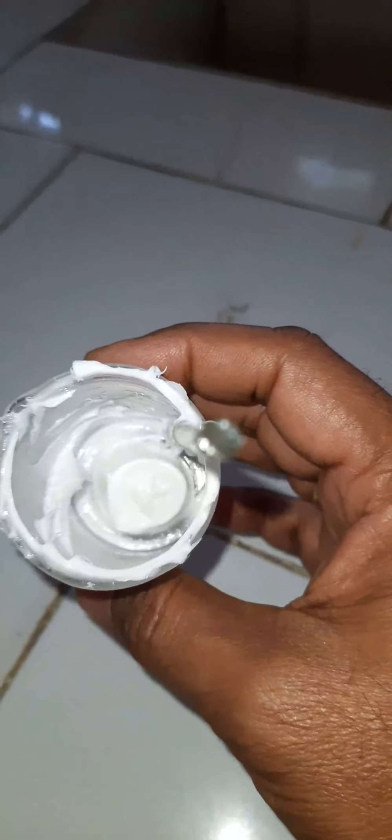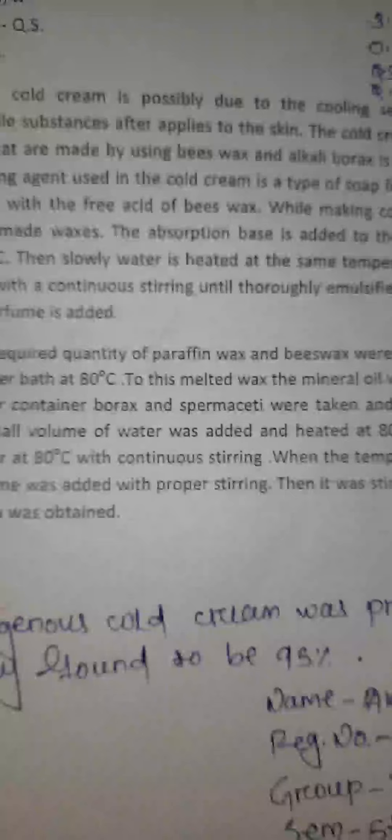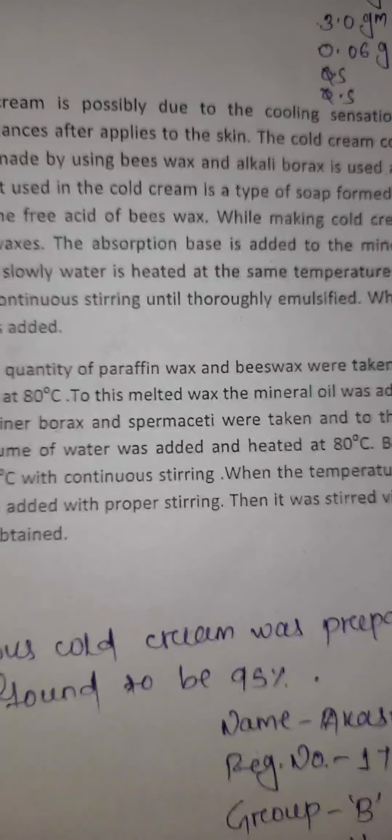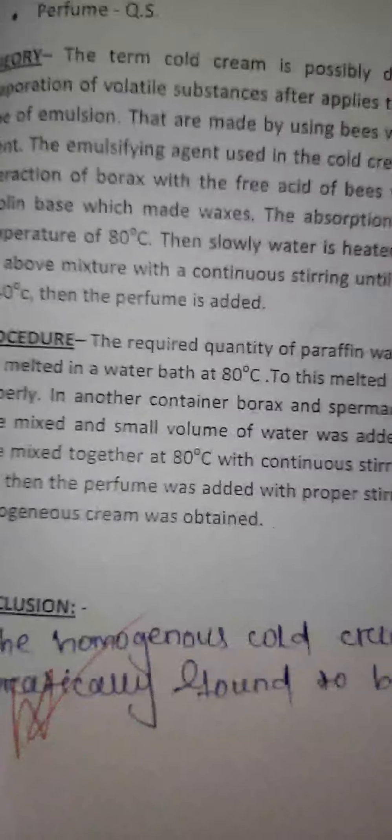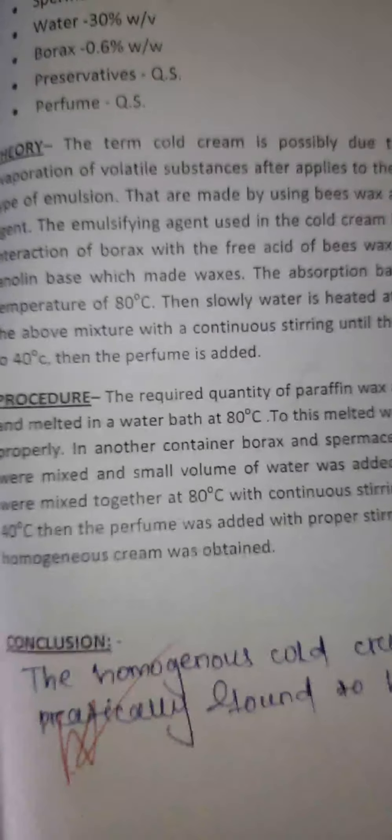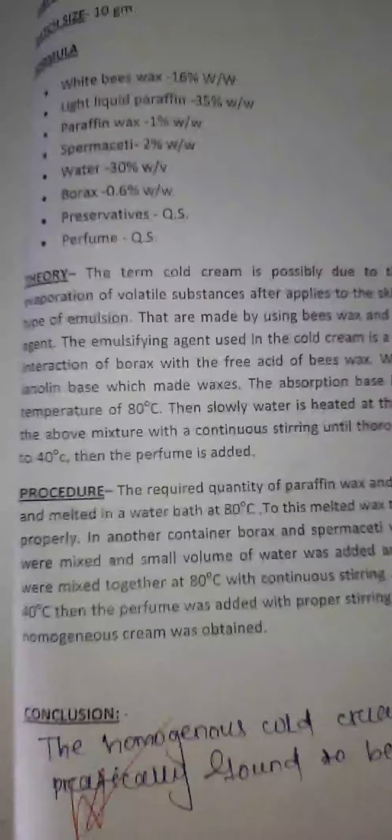Now the cold cream has been prepared. This is the homogenous cold cream. The conclusion is that a homogenous cold cream was successfully prepared, and its practical yield was determined by weighing the cold cream on the balance.